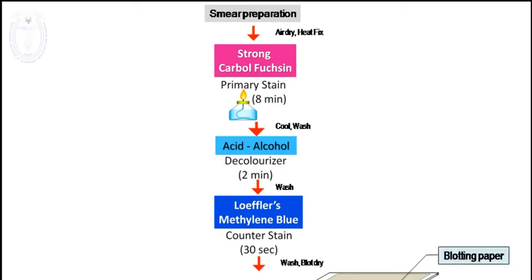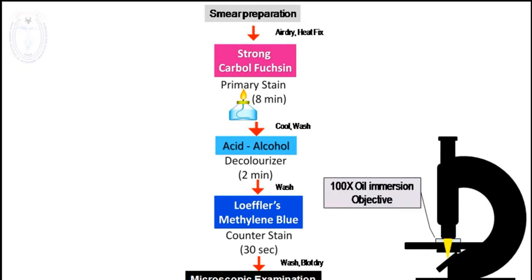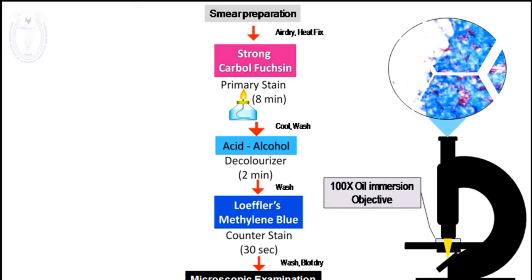Place the stain slide over the stage. Examine the slide under 100x oil immersion objective microscopy. With this, we are coming to the end of the Acidfast staining technique. The detailed protocol for the Acidfast staining technique is available as a downloadable link in the YouTube description below.